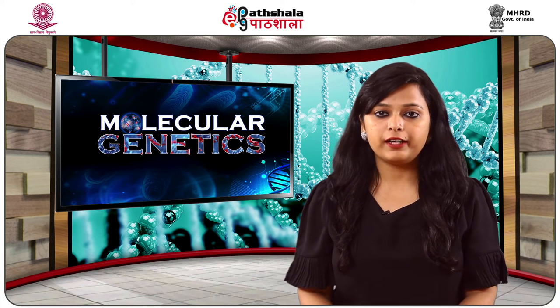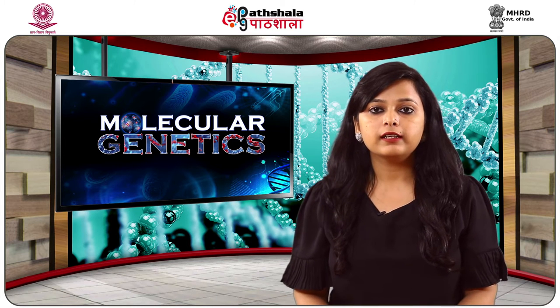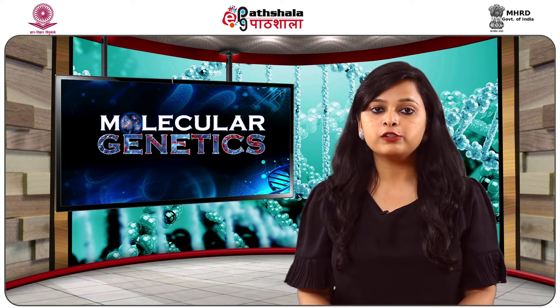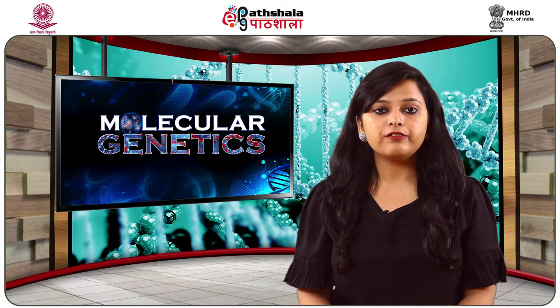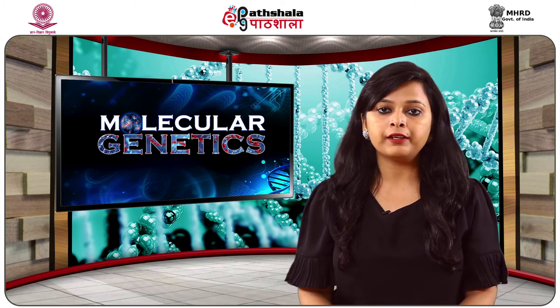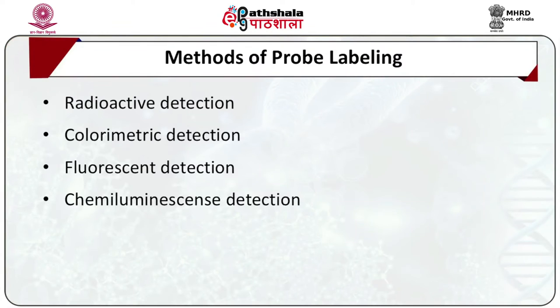The short half-life of P32, 2 weeks, contamination hazards, and the expenditure involved in disposing of this radioactive waste are the main drawbacks of this labeling method. Currently, various non-radioactive detection methods like colorimetric, fluorescent, and chemiluminescence are available. First of all, we will discuss colorimetric detection.